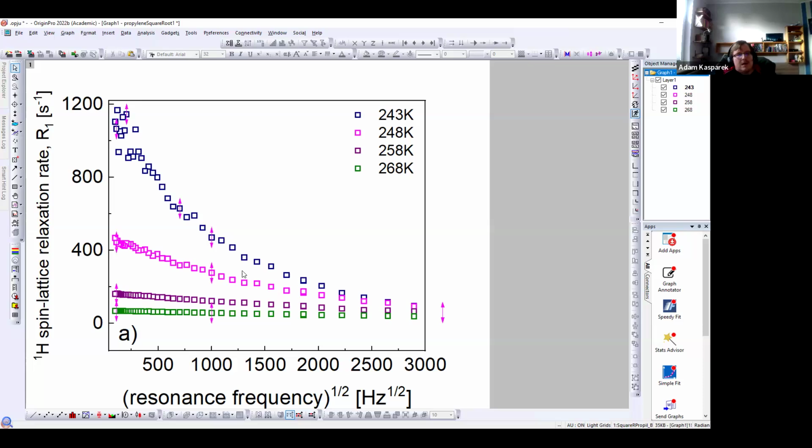Second, for example, it can have additional motion included in this model. So for example, here we can expect that this change of the shape may result from rotational movement.